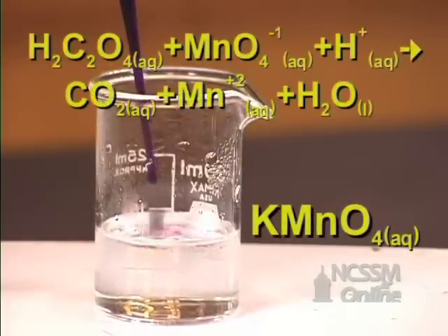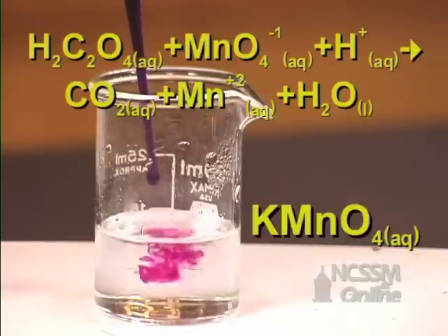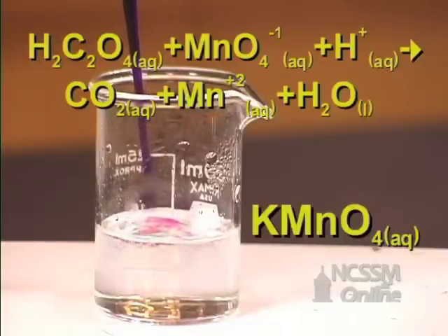We notice that the color disappears rapidly. Increasing the temperature increases the rate of the reaction.